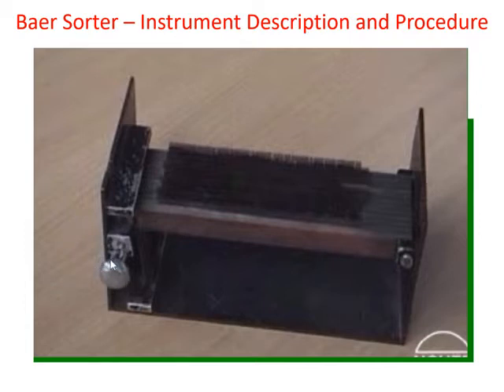There is a knob here. By adjusting this knob, each bottom comb can be dropped. This knob can be put on the other side also. This is the back side of the instrument, and on this opposite side, you are looking at the back side of the instrument. There is another side, the front side, which is slightly inward. The back side is towards the edge.